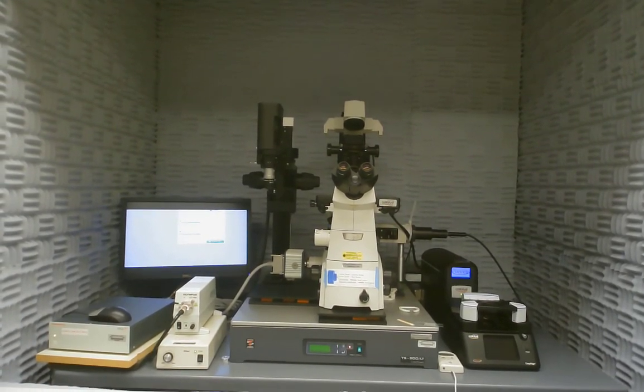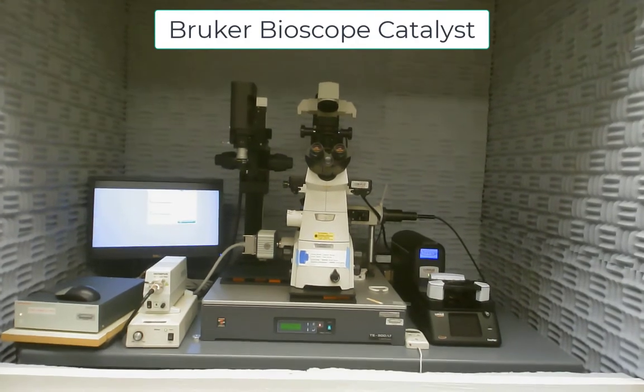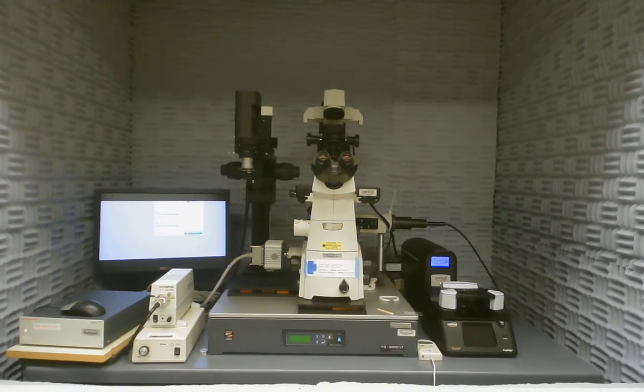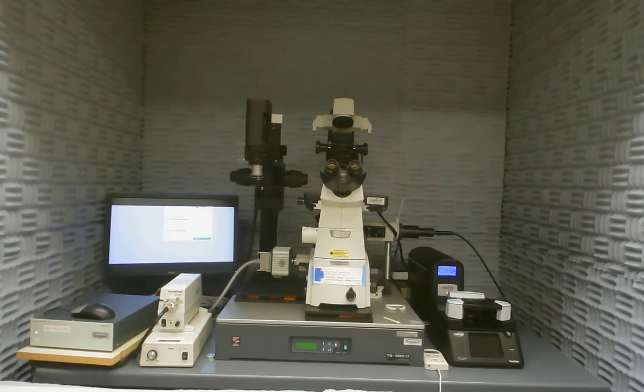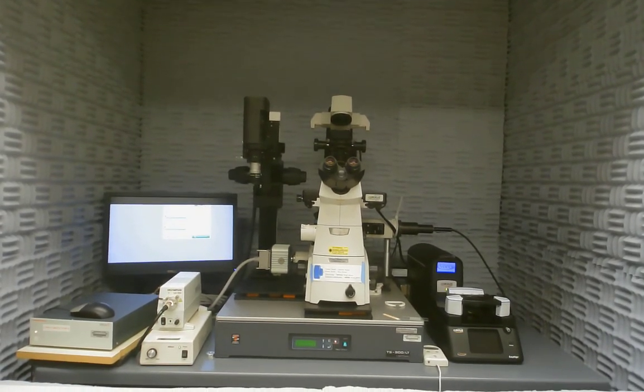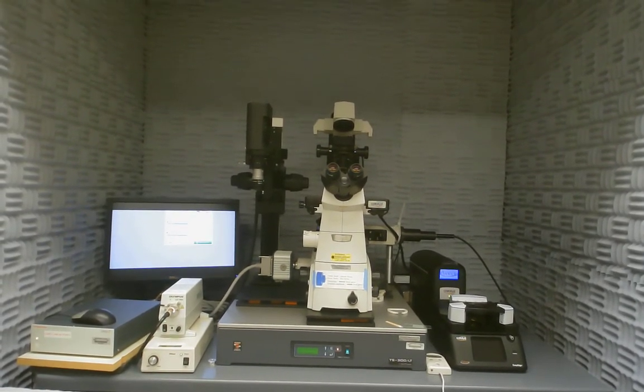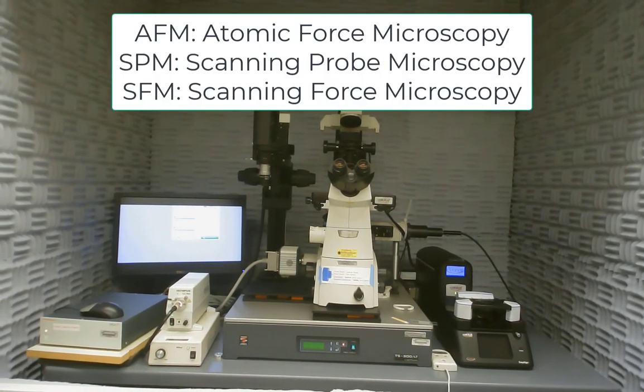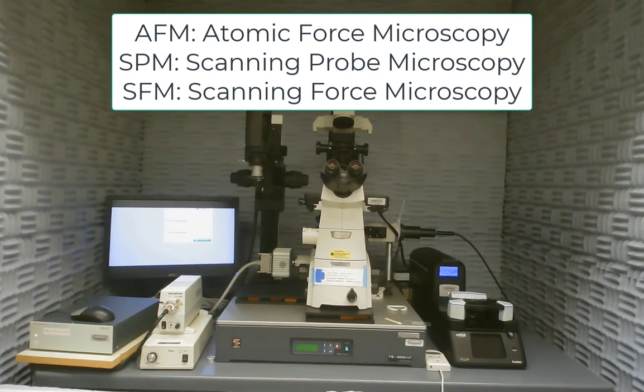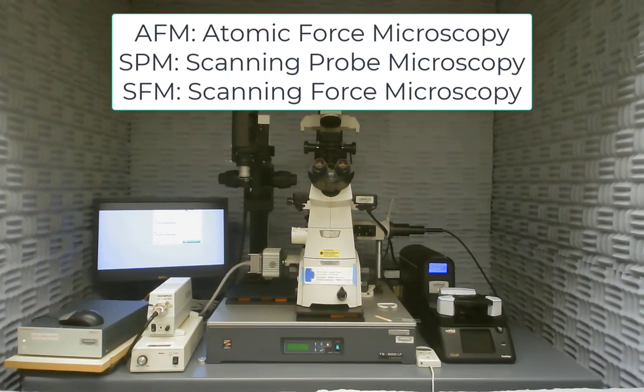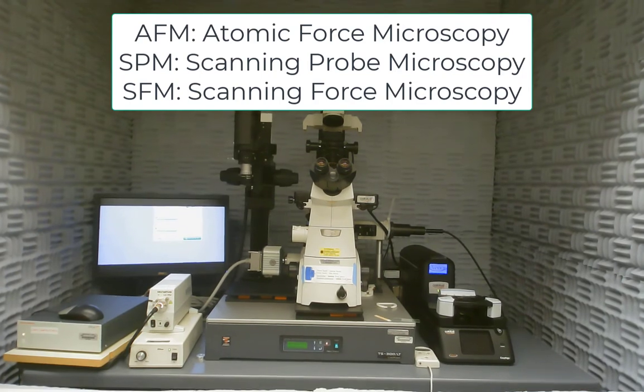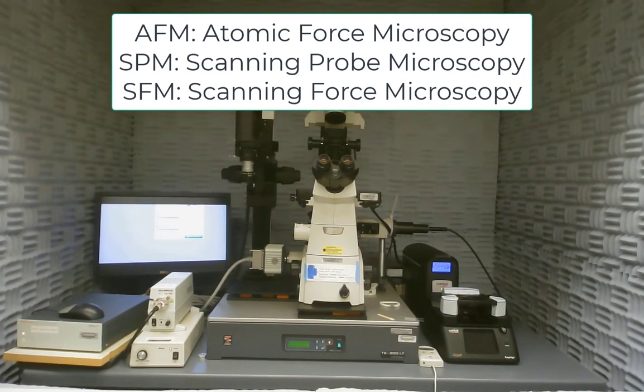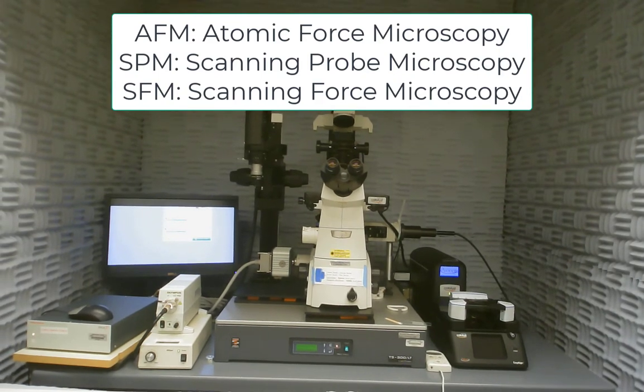This is a Bruker Bioscope Catalyst AFM. It was purchased in around 2006 to 2007. The purchase cost was around $120,000. And as a reminder AFM stands for atomic force microscopy. There are other acronyms that are sometimes used such as SPM or scanning probe microscopy. But they're generally just referring to the same exact thing.